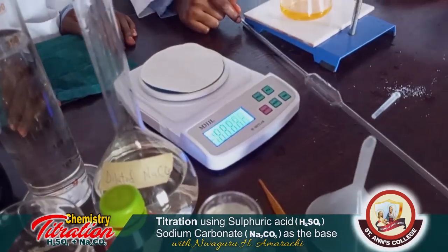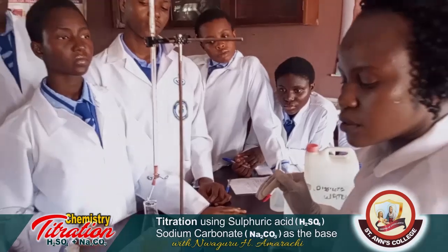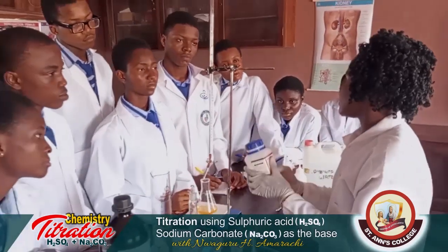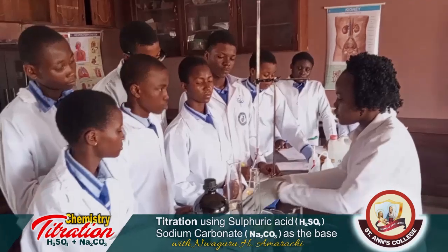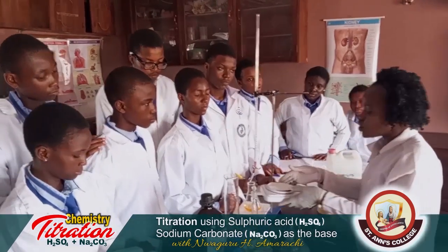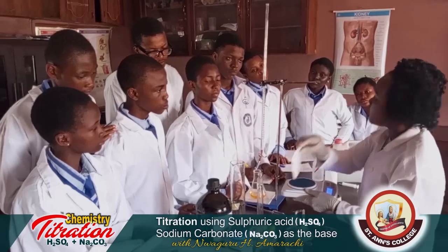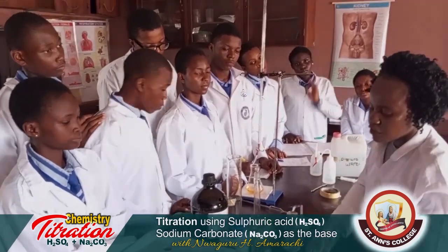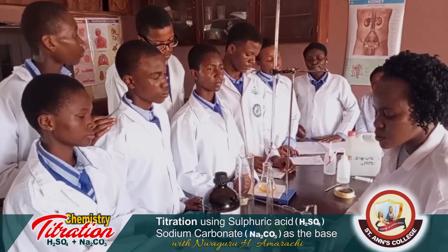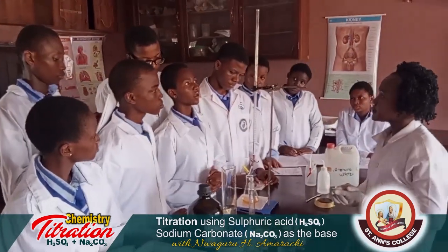Now the weight of the filter paper is cancelled out, so it will give you the actual weight of your quantity of base. These are part of your precautions. If you didn't take this precaution, you will add up both the weight of the base and the weight of the filter paper, which may give you a wrong measurement.